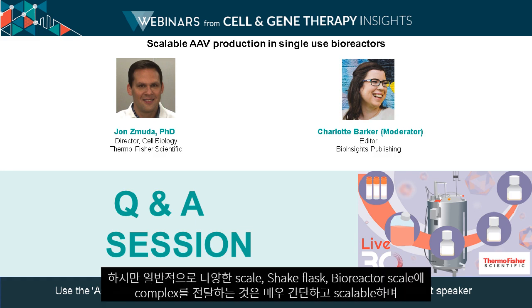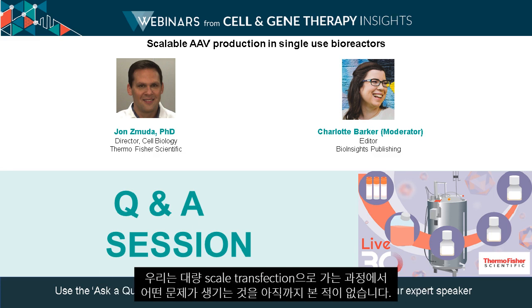But generally speaking as well, in terms of delivery of the complex to the different bioreactor scales, the wave bags, shake flasks, et cetera, it's been quite straightforward, very scalable, and we really haven't seen any hiccups even going to these larger scale transfections.